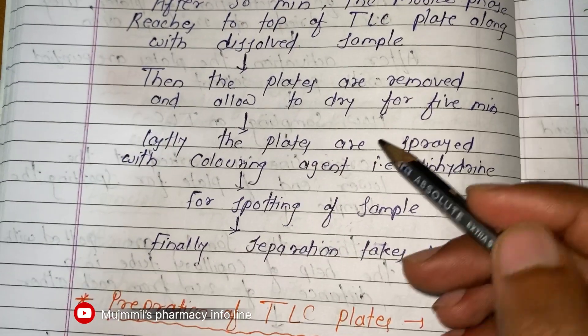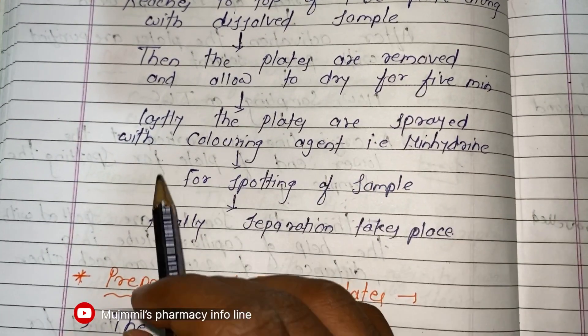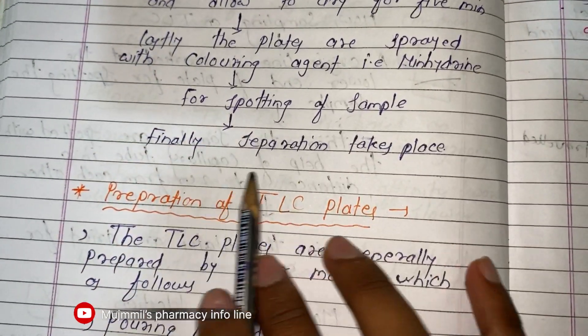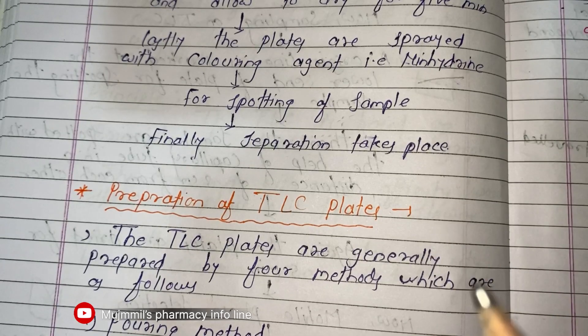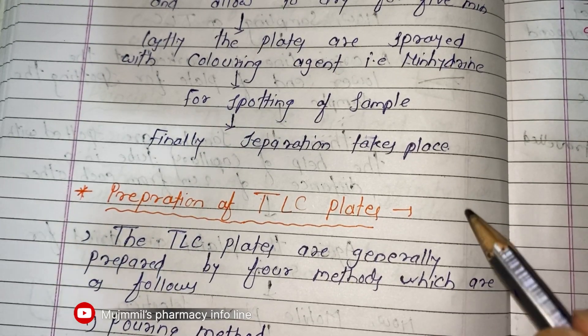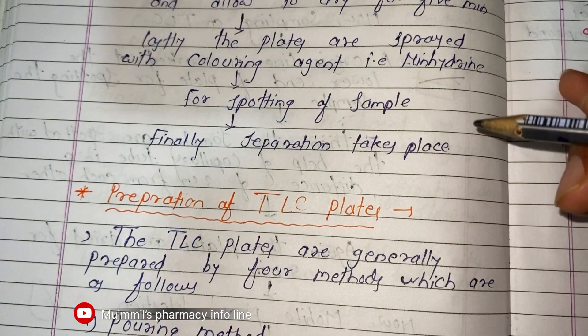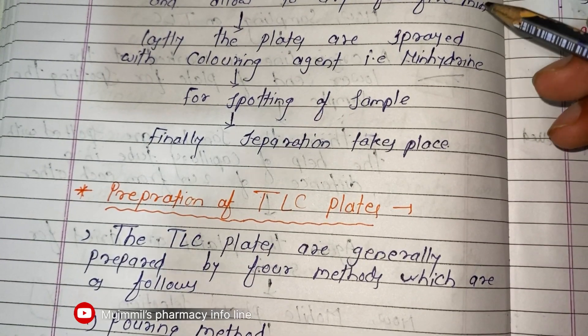The plates are then removed and allowed to dry for five minutes. Lastly, the plates are sprayed with a coloring agent — ninhydrin — for spotting of the sample. Finally, the separation takes place. This is the basic step-by-step process of thin layer chromatography and how we perform TLC in practical.